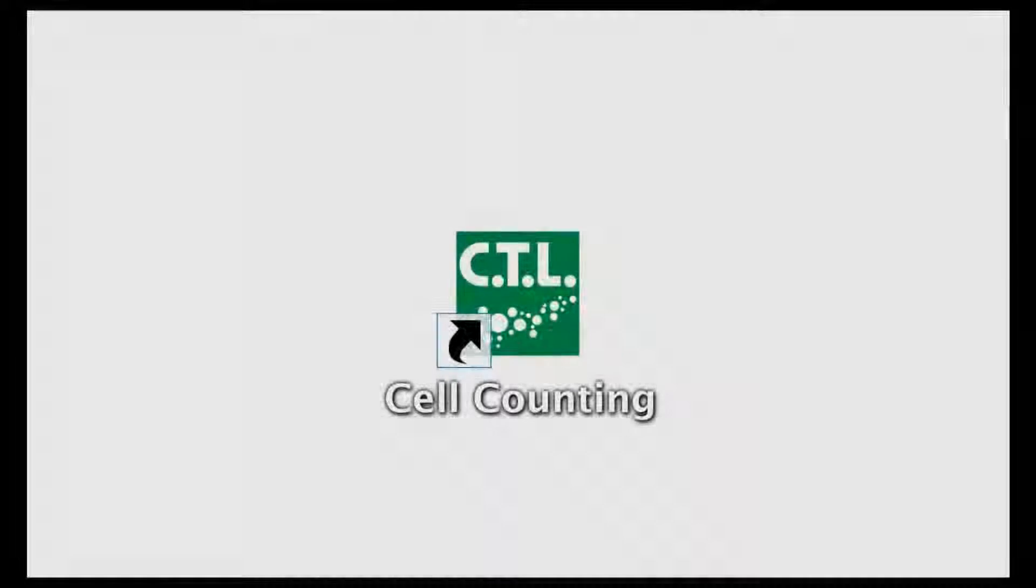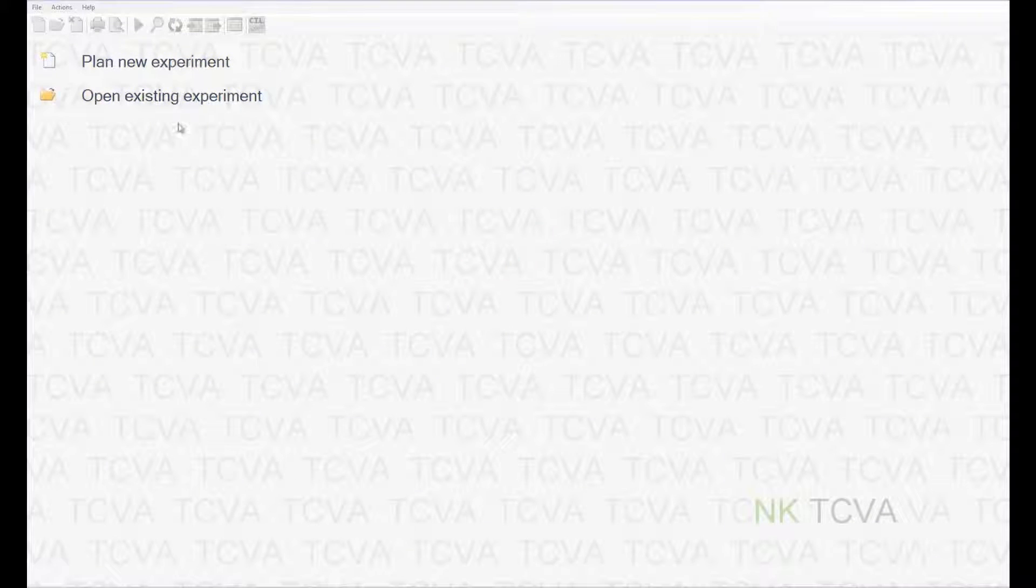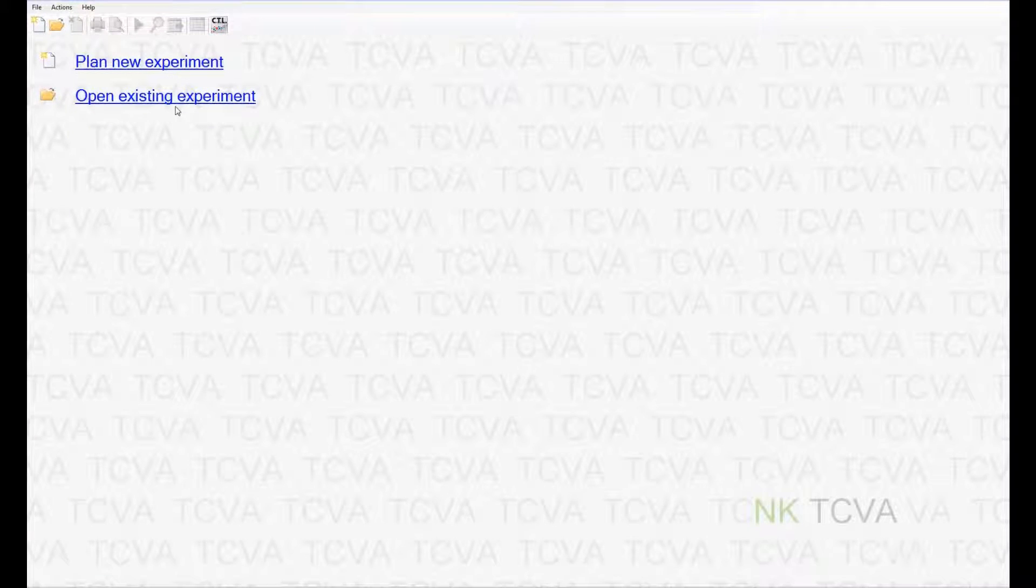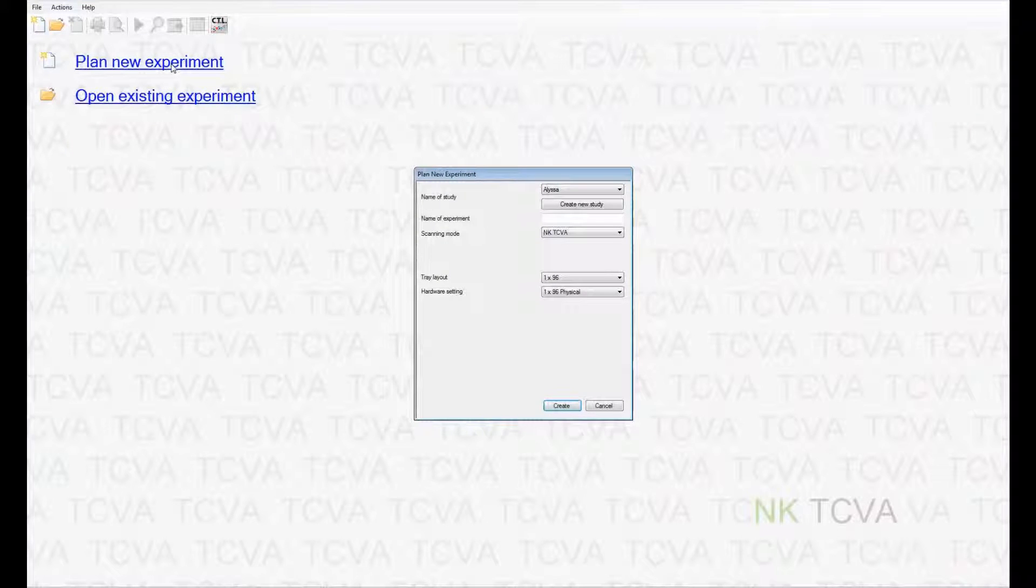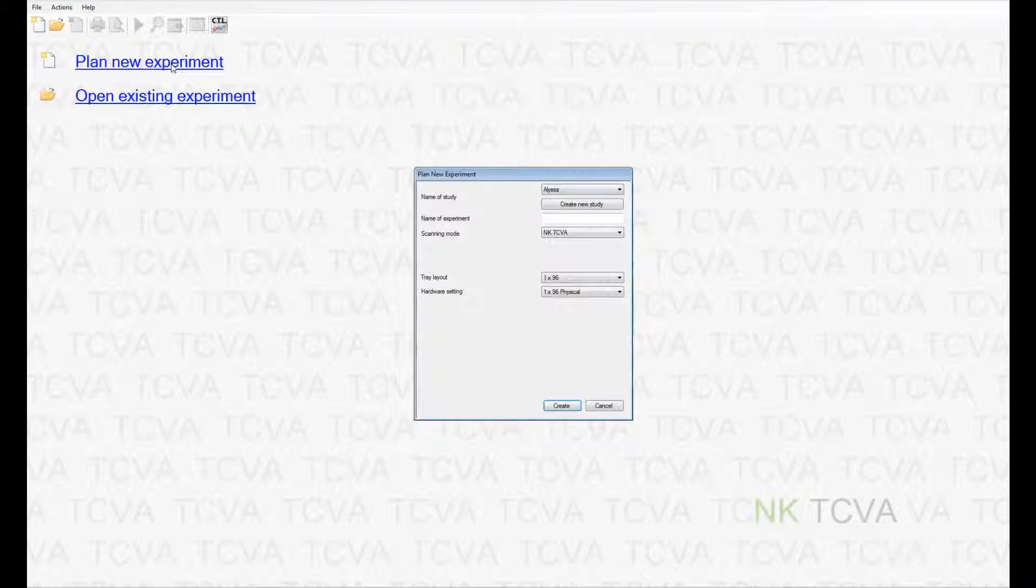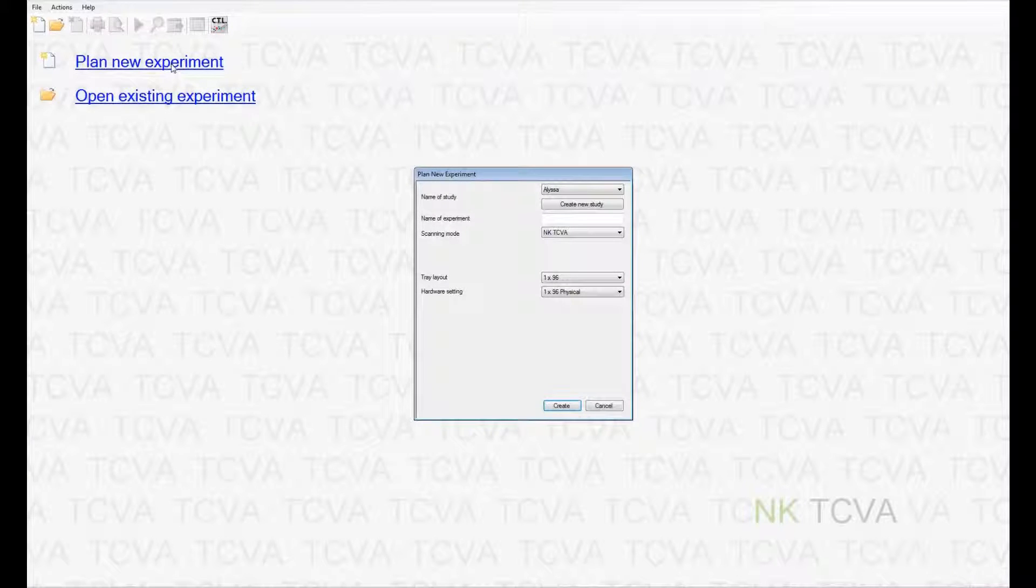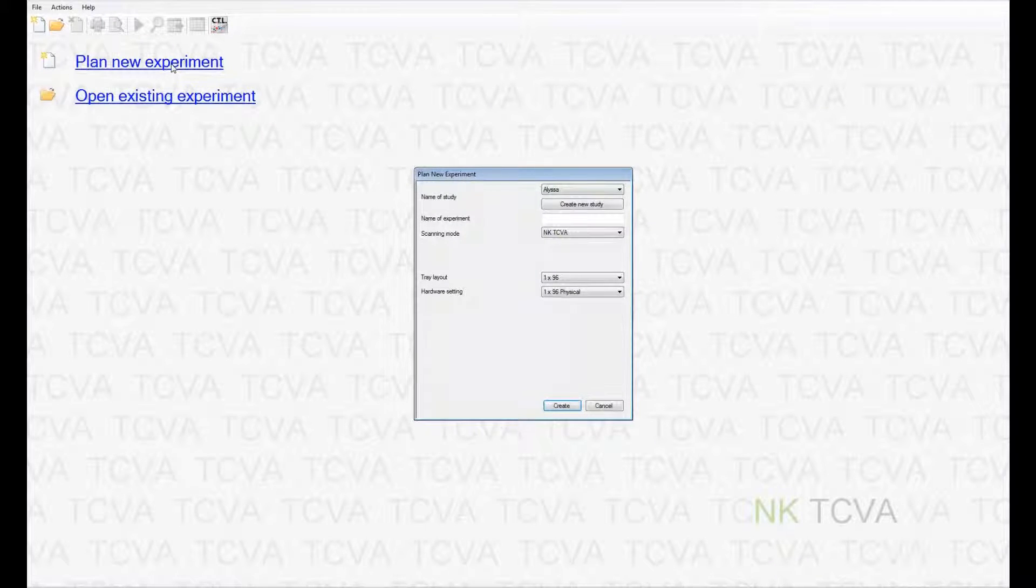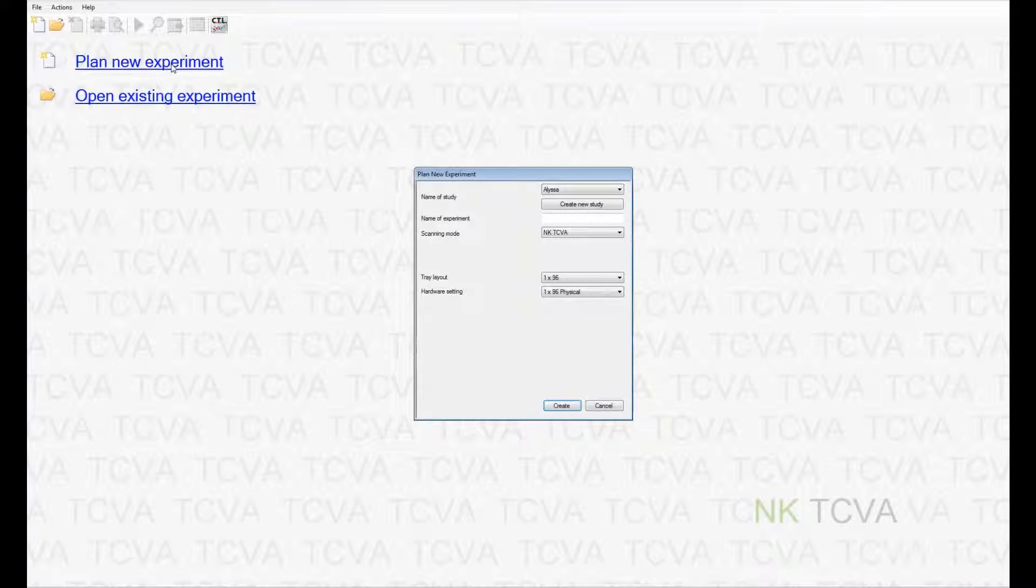On launching the CTL cell counting software icon, you can either open an existing experiment that was performed in the past, either to view the results or to add more plates, or if you are starting a brand new experiment, you should launch the plan new experiment link. This launches a window which requires that you enter some details about your work.